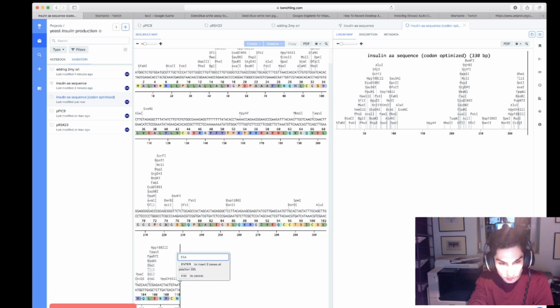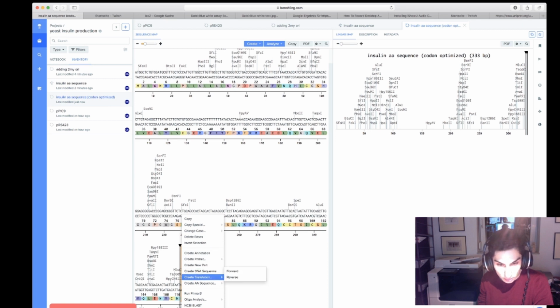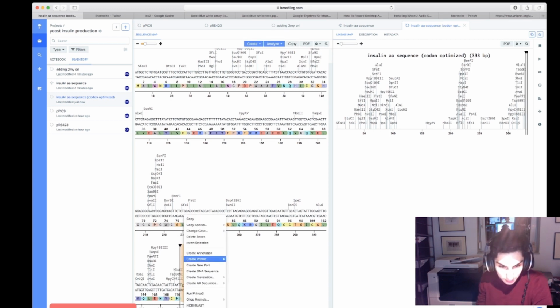TTA should work. Right, try TGA. Or TAA? Oh, okay, TGA. Okay, yeah.